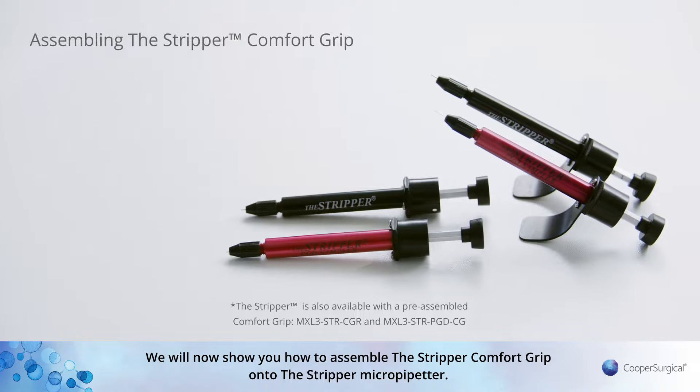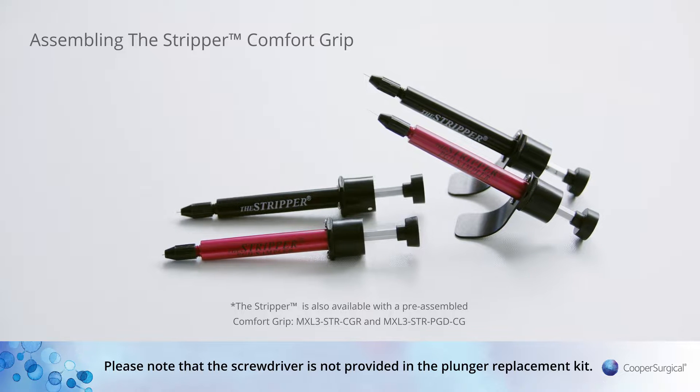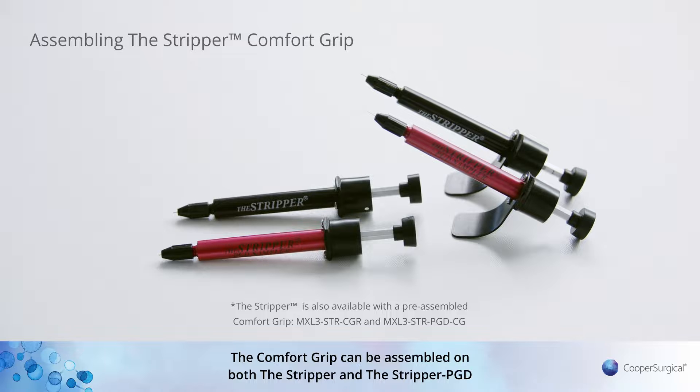We will now show you how to assemble the Stripper Comfort Grip onto the Stripper micro-pipetta. Please note that the screwdriver is not provided in the plunger replacement kit. The comfort grip can be assembled on both the Stripper and the Stripper PGD.